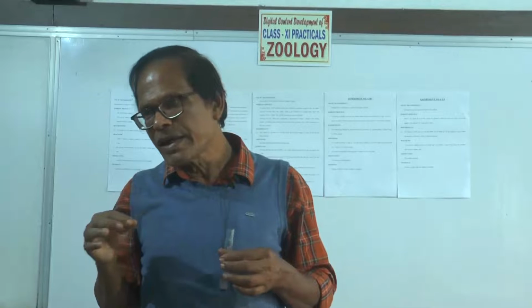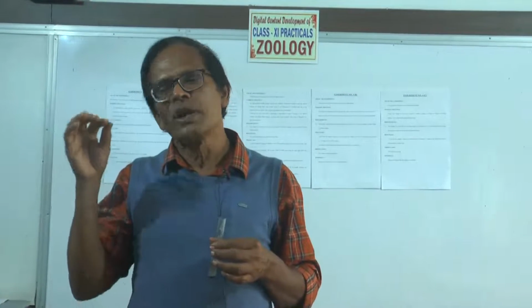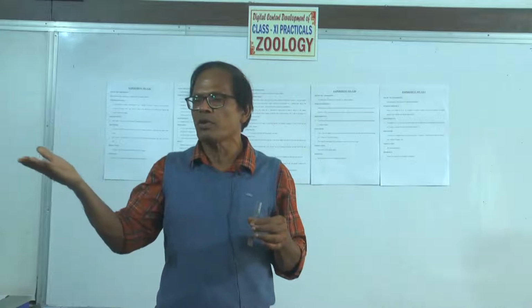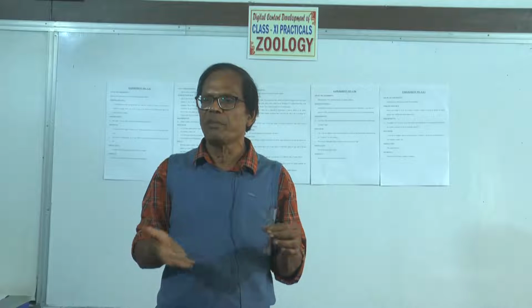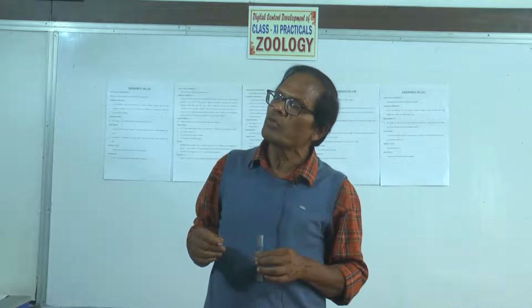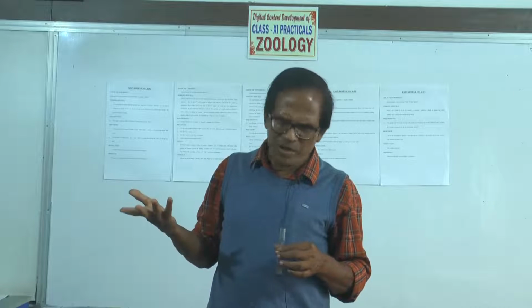At the higher secondary level, we advise to go for the Molisch reagent from the market, not prepare it, because it takes a lot of time. Alpha-naphthol and absolute alcohol have to be mixed. Maybe it won't materialize. Anyway, we always advise to go for reagents from the local market. Commercially, everything is available.